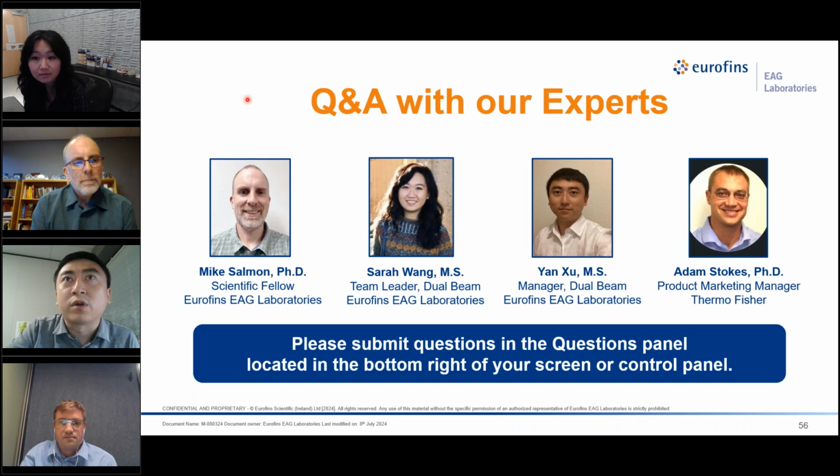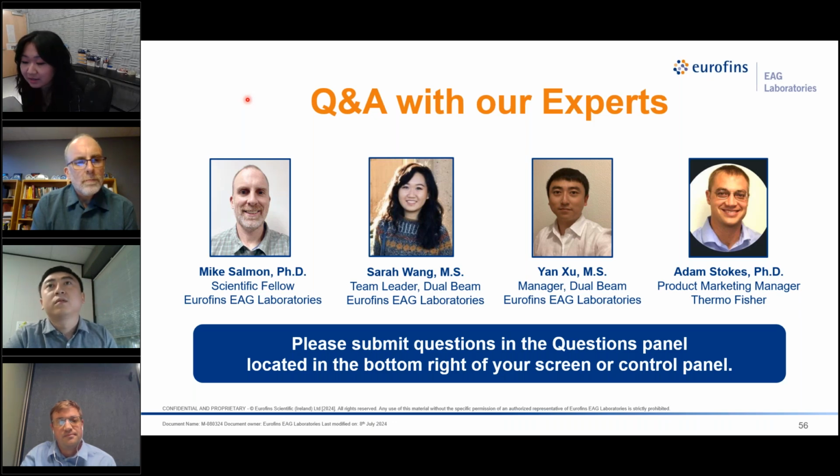And Sarah, there's a question. What is the volume you can do for 3D tomography? So that's a great question. It depends on a lot of things like your desired step size and basically the time you want to spend on the tool. So we can go up to maybe 300 by 300 by 300 microns in volume, but that would take a really long data acquisition time. So I think it's usually wise to pick the smallest volume that will still get you the statistics that you need for your project, based on the particle size or what you're trying to probe. But with PFIB, yeah, on the order of hundreds of microns, whereas for gallium FIB, probably just tens of microns.